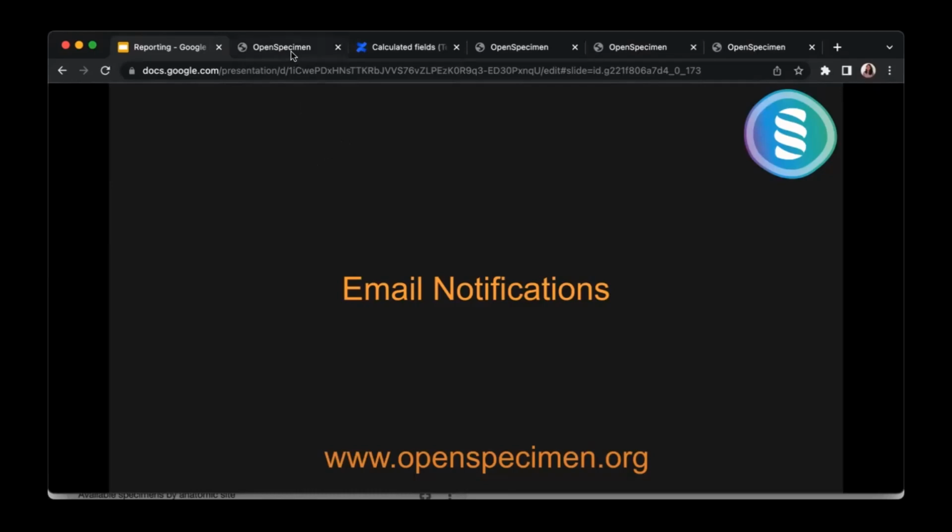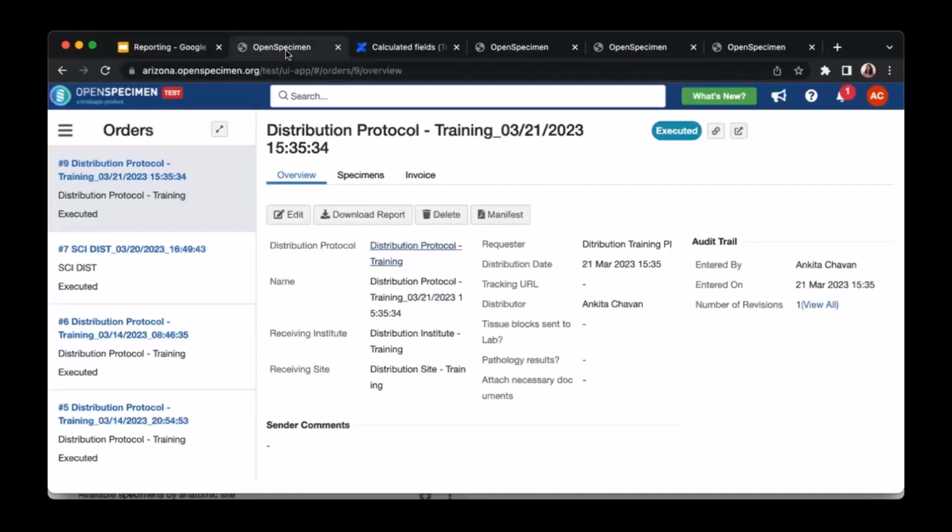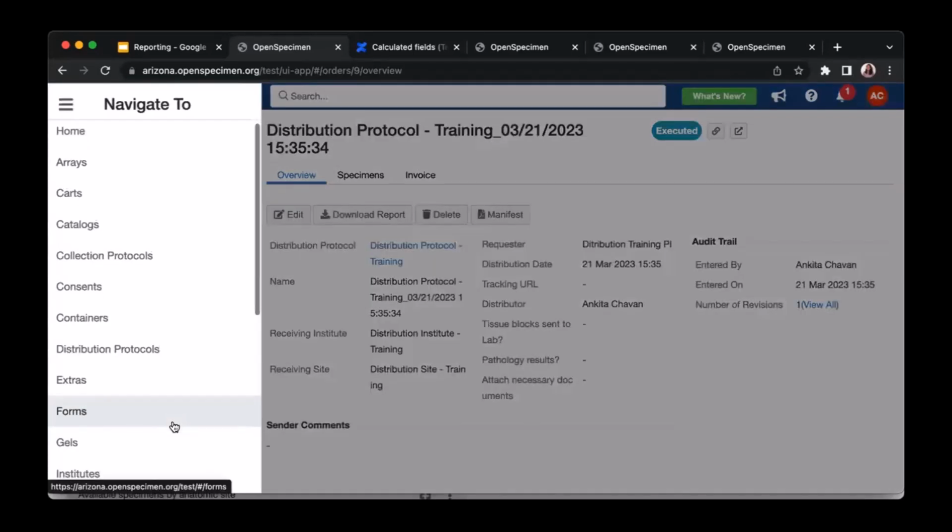Yeah, you can also do that. She'll explain how to configure it so that you don't really need to log in.